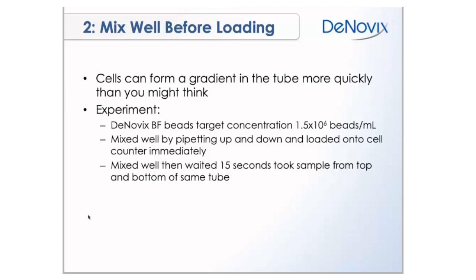So I just did a quick experiment, took some beads, a target concentration of 1.5 million beads per mil, mixed them well, loaded them onto the cell drop. And then I did the same thing, but then I waited about 15 seconds from after I mixed the beads to when I loaded them on the cell drop. Kind of thinking if you were to get distracted, if someone were to come into the lab and ask you a quick question, or were to look down on your phone and see a text message, this is going to distract you for about 15 seconds.